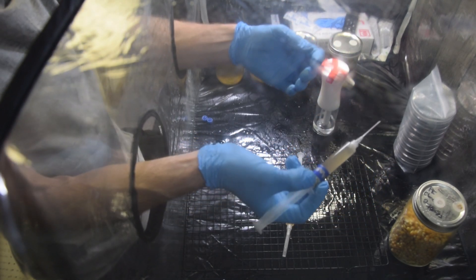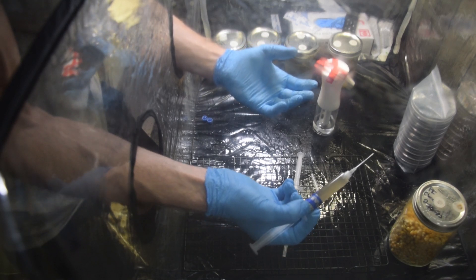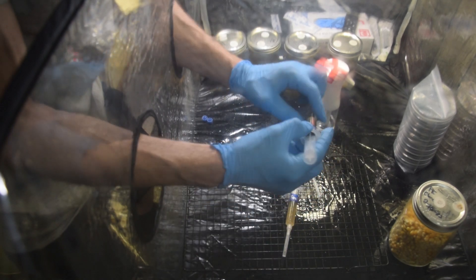Liquid culture is much quicker to spread and take — to launch, to expand, whatever you want to call it. So a lot of people prefer to use liquid cultures when possible. I have a liquid culture here.